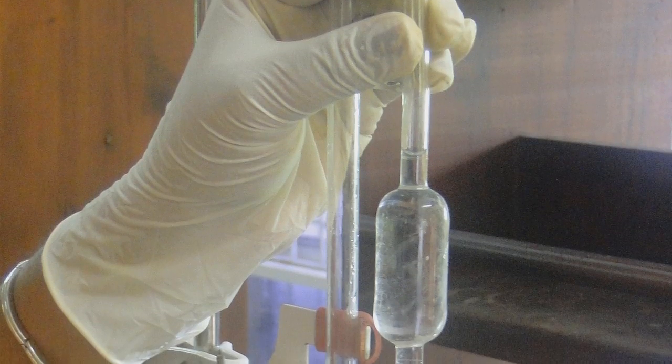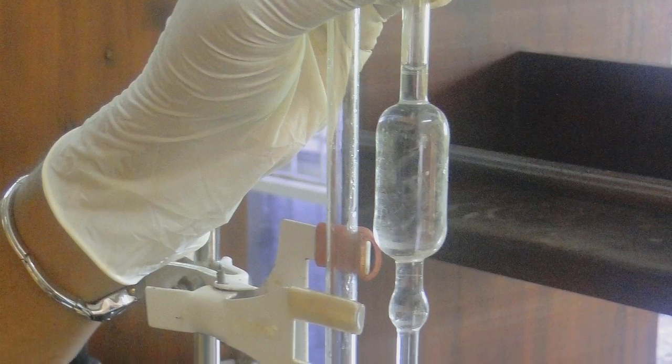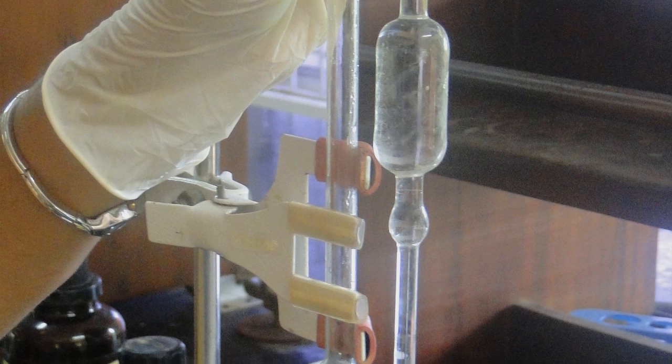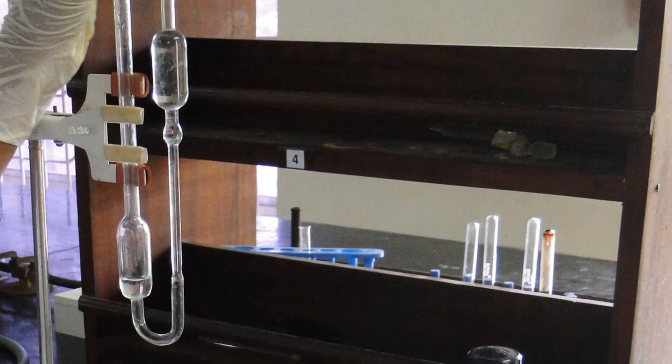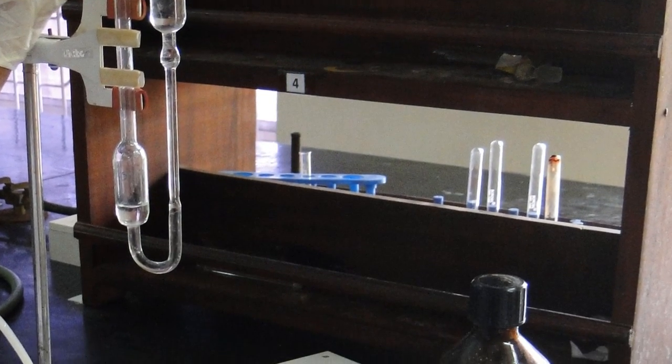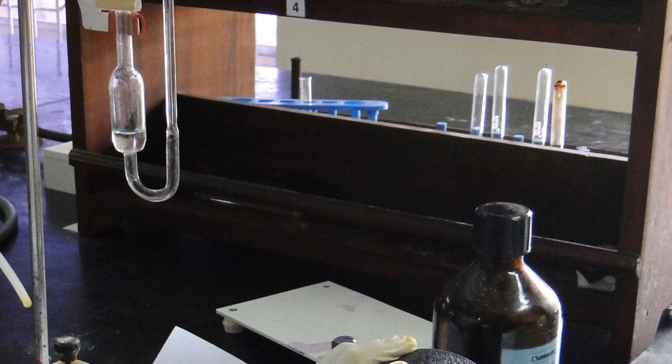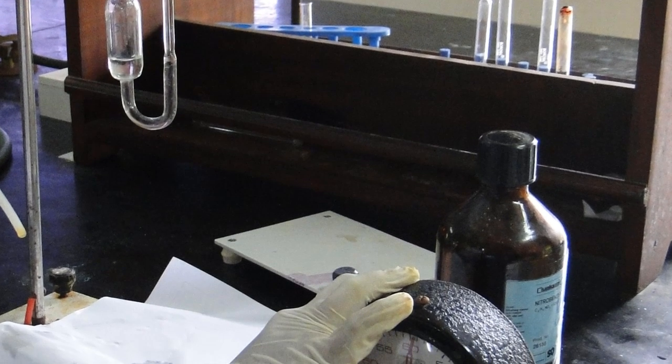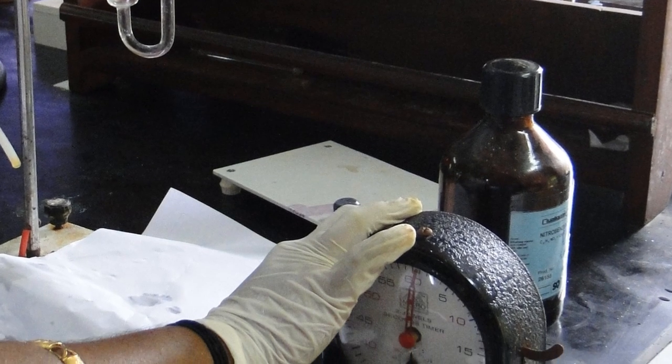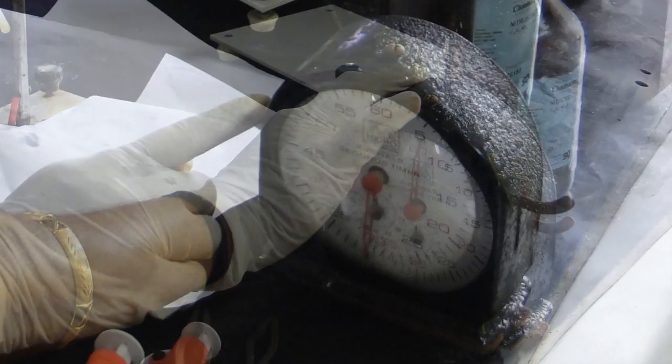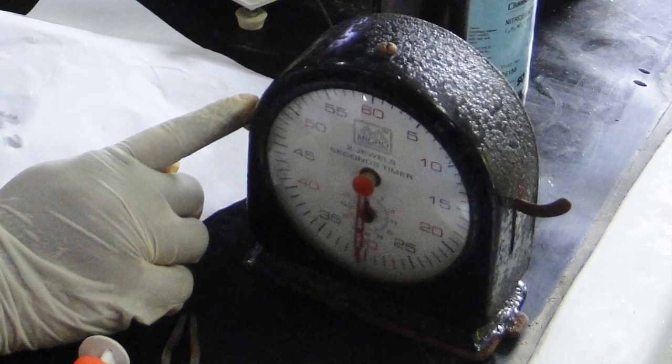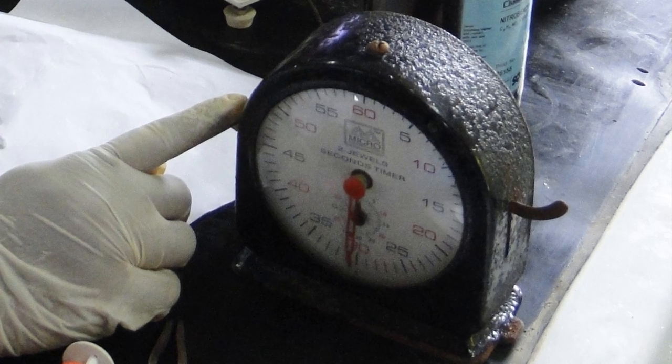Using the pipette pump, suck up water until it rises above the upper mark C and allow it to flow under its own weight. The time of flow of water from C to D is counted by starting the stopwatch as the meniscus just passes mark C and stopping as it passes the lower mark D. Take at least three or four readings with water and then take the mean of them.